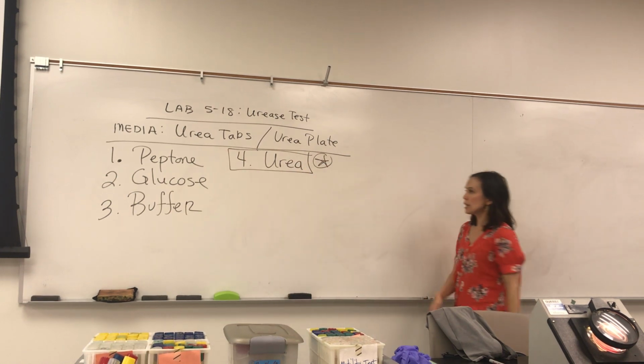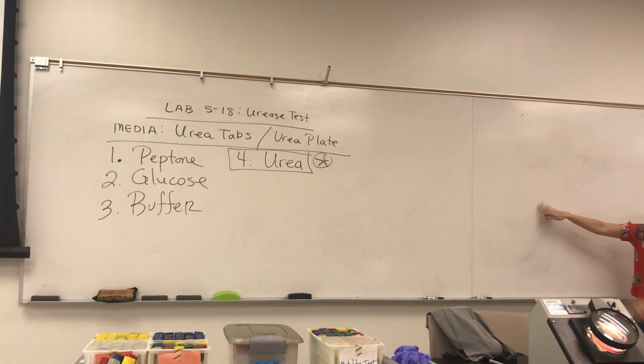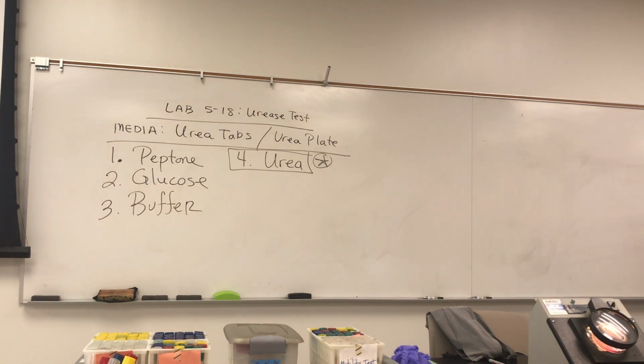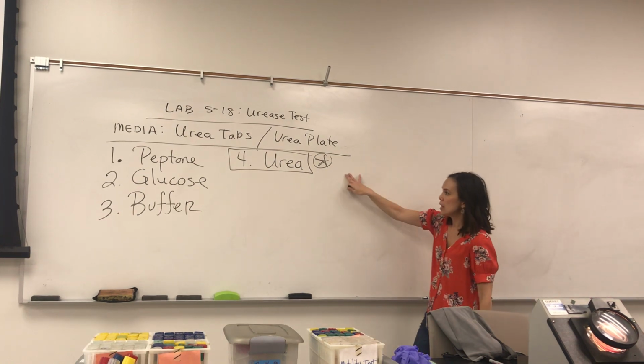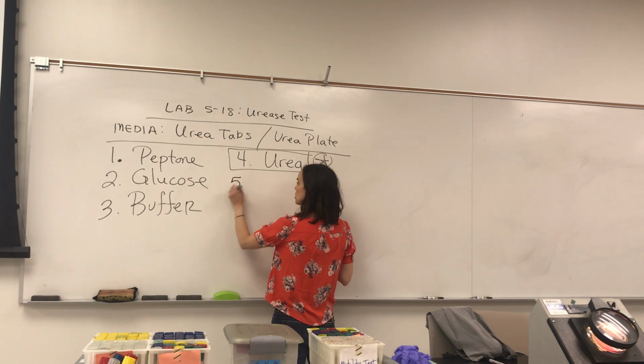So to clarify, this lab is not a fermentation lab. We're just going to home in on one enzyme that breaks down urea, but it has nothing to do with fermentation. And then other than that, it's just phenol red.